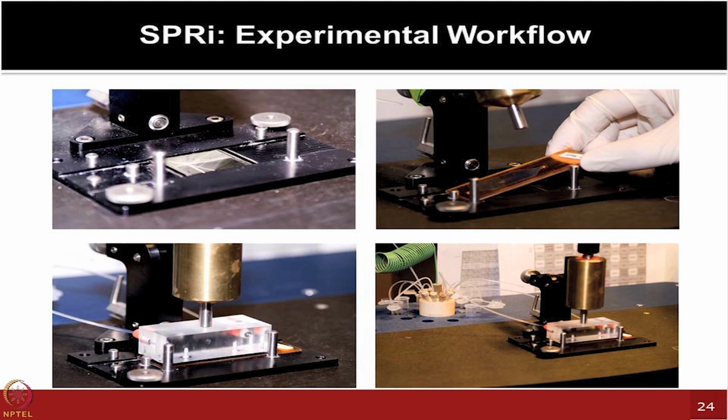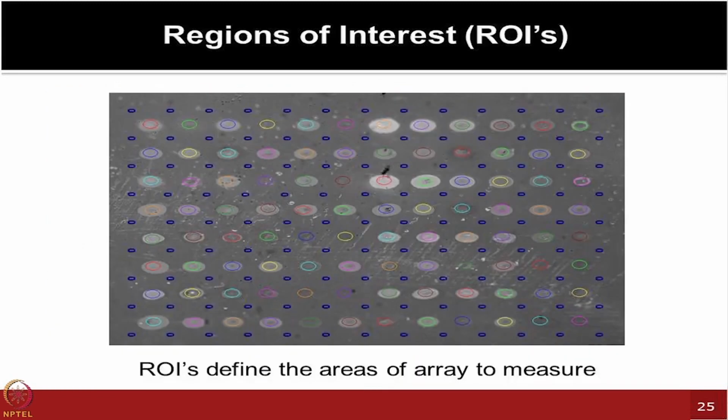So these kinds of platforms could be used, and they result in these images, which are the pseudo images that I mentioned to you. It shows you these kinds of spots. Now all these red, green, what is shown here, these are actual spots, but along with them, whatever you see, the gray color is just the background. So software artificially adds some blue colored dots. These spots could be used for subtracting the background.